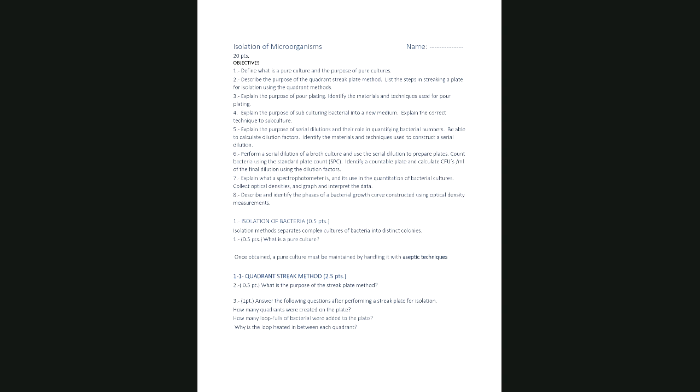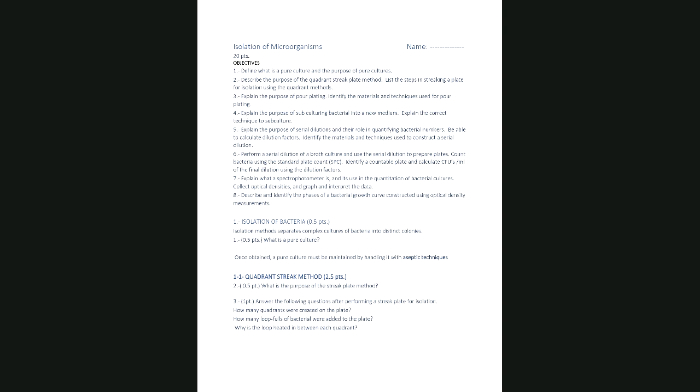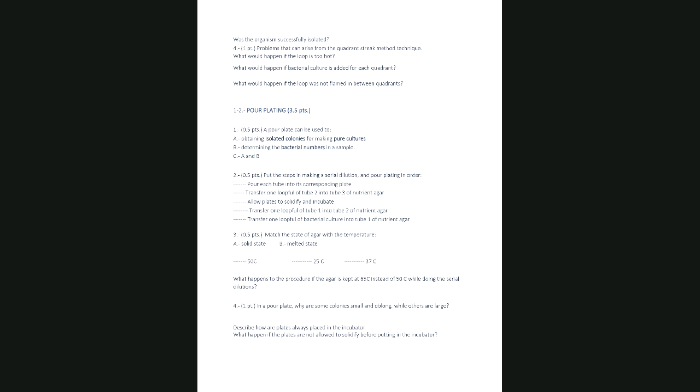Okay, let's see. All right, this is not as I thought. Give me a second. Okay, let me go down. There we go. Quadrant streak method. Perfect. The other methods that we're going to look at are the pour plate and the spread plate, I think. Maybe not. Let's see. Pour plate.